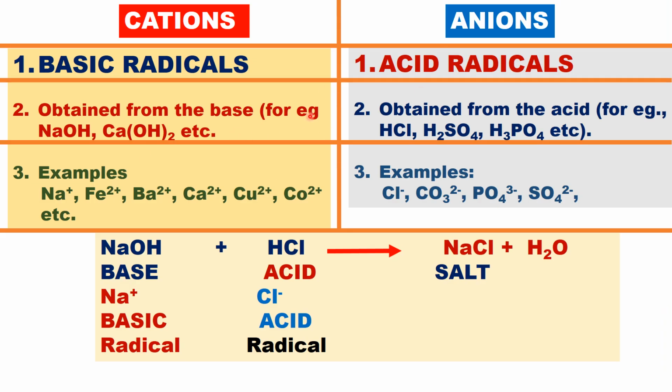Before we study salt analysis, we must know what a salt is. A salt is formed by the reaction between sodium hydroxide and hydrochloric acid, an acid-base neutralization reaction. When the salt is dissolved in water, it gives sodium ion and chloride ion, Na+ ion and Cl- ion.